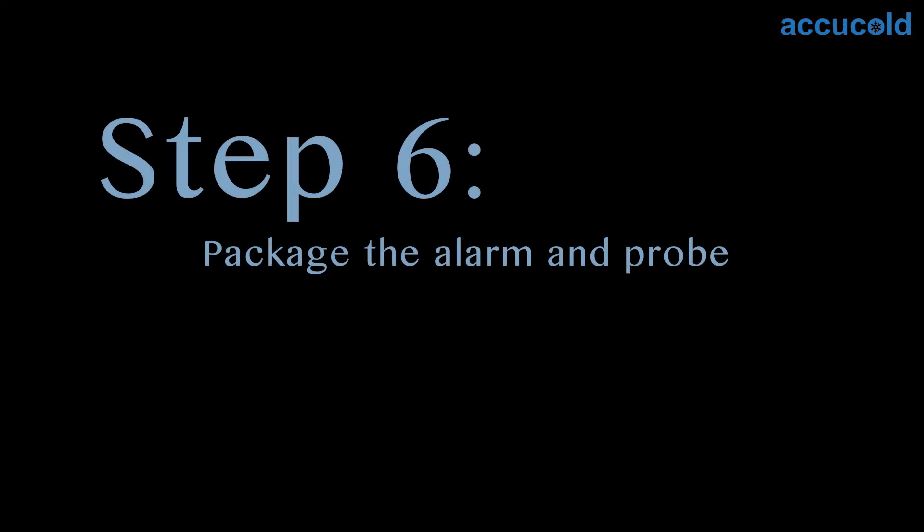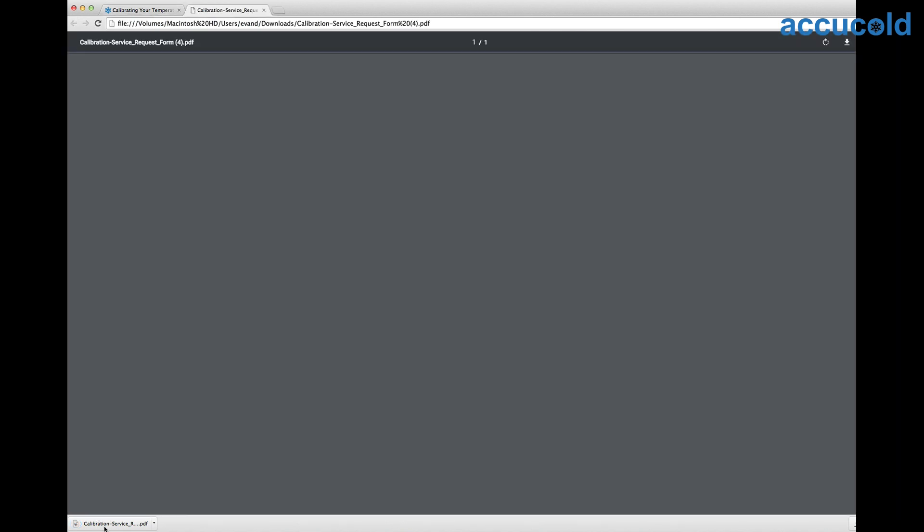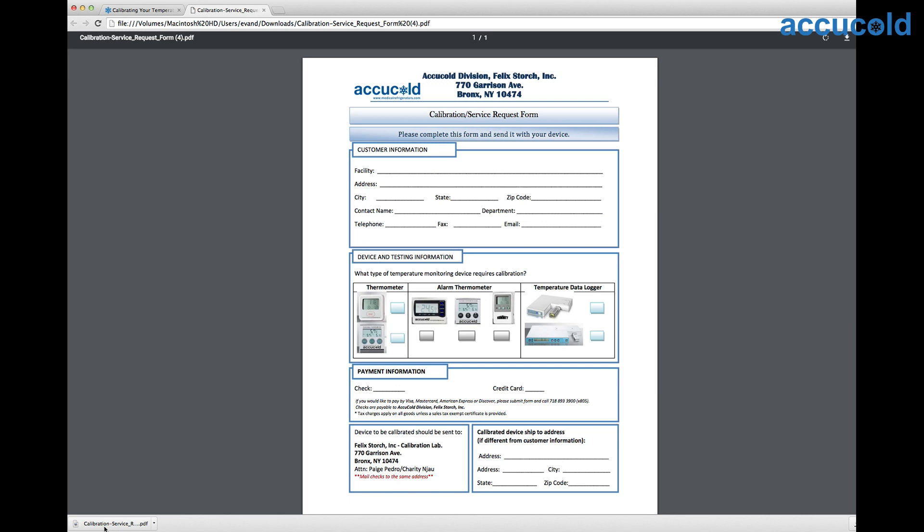Step six, package the alarm and probe. Visit accucold.com/calibration where you can find directions for payment and download the recalibration form. Fill out the form and follow the instructions on how to return it to the AccuCold lab. Package the thermometer and probe and ship it to the address provided on the form.